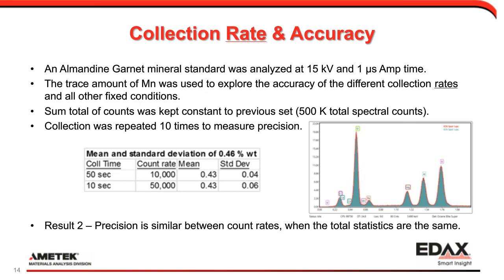And so by doing it 10 different times, we could see just a little bit of variation in the standard deviation. And the 50,000 counts per second gives us maybe a little bit larger dispersion, a little bit larger standard deviation. And a note here is that this is why we're reporting the results in terms of precision, because with standard deviation, we look at the spread of the results, and the precision tells us how close repeated attempts are to each other and to the mean value.